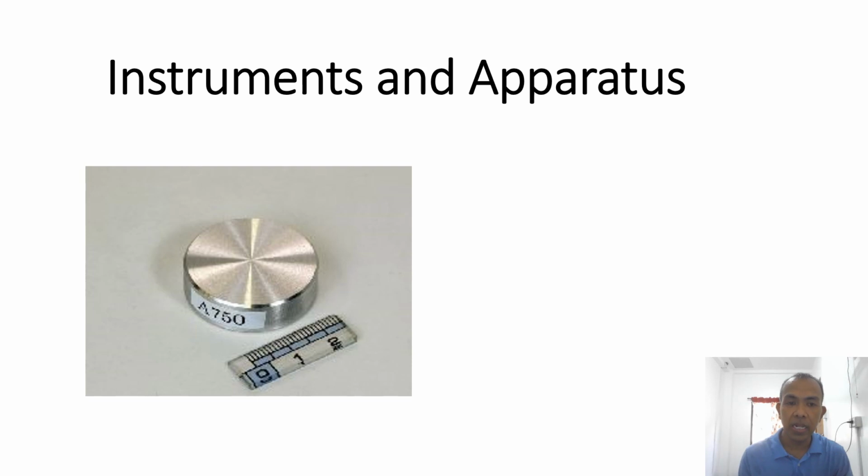They can still analyze the amount of antimony. Kumbaga nasa range pa rin siya, mahahagip pa rin siya. Hindi na siya naka-itemize. Pero we can buy a certain chip of this, if you want to see antimony itself, may ganong variant ng calibration chip. 2 centimeters wide lang siya.